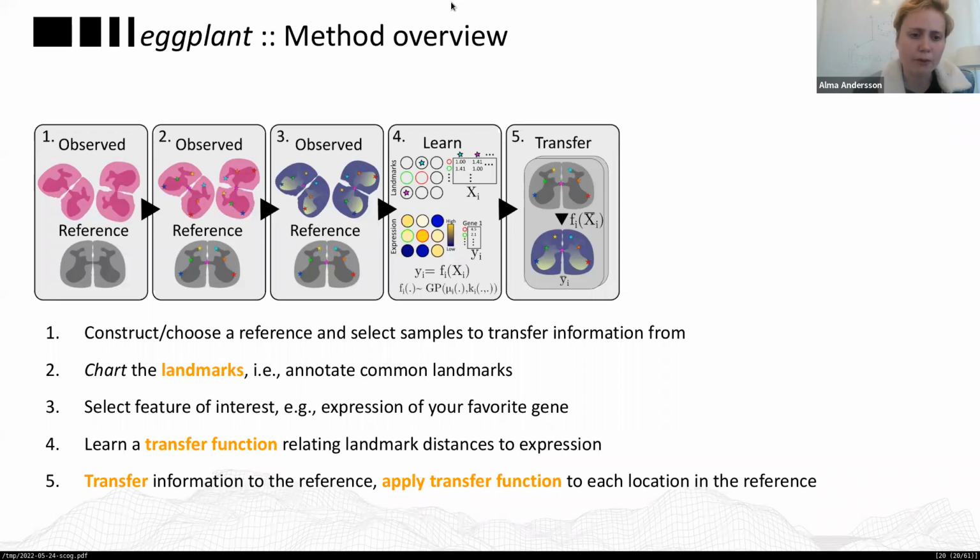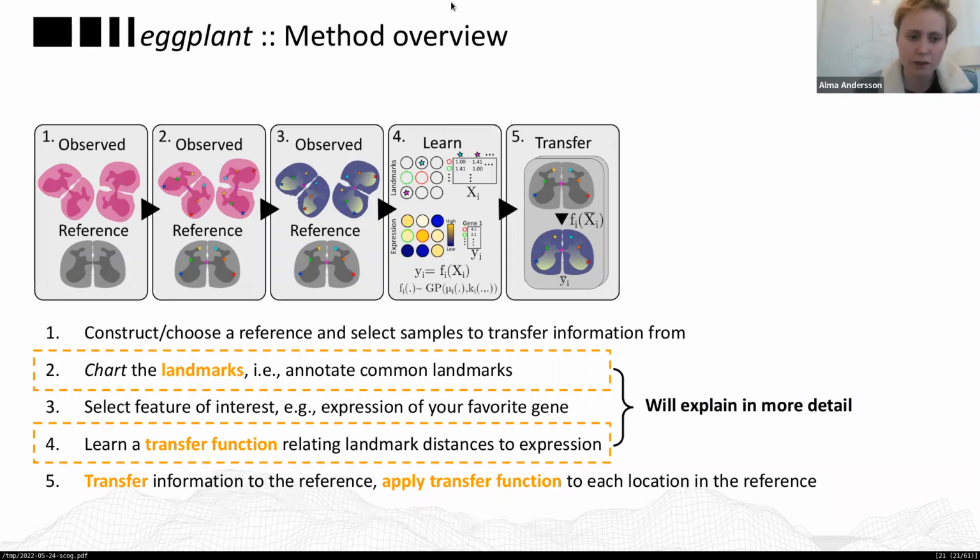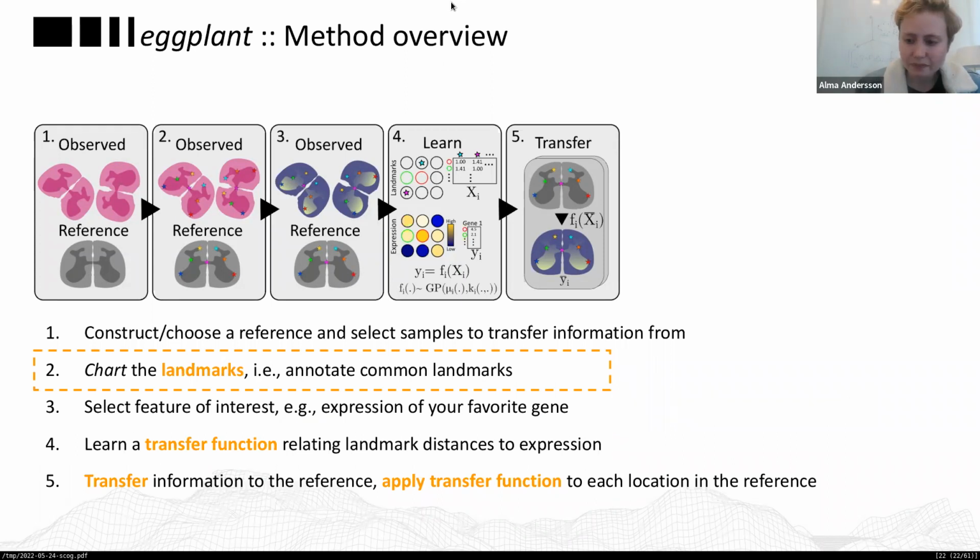And now there are 2 parts here that I would just like to spend a bit extra time on, because maybe it's not super obvious what I mean with them, just from this very brief introduction. And those are the landmarks and the transfer function. So let us start off by looking at the landmarks here.